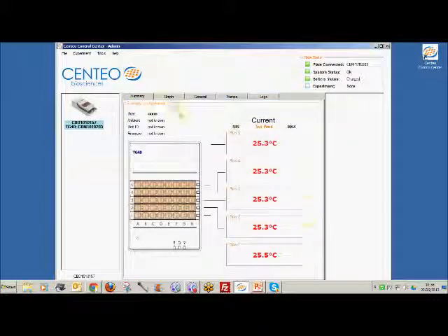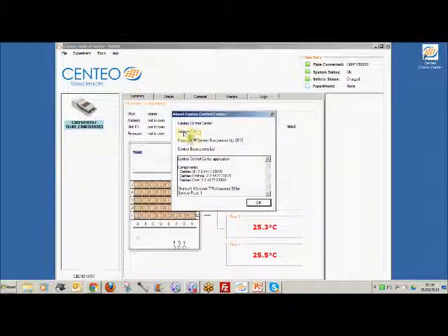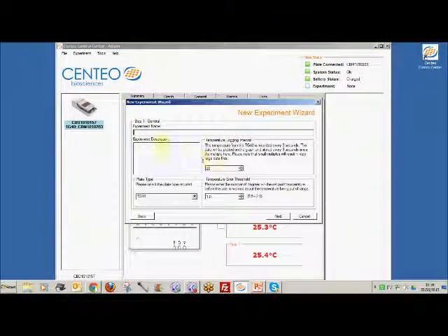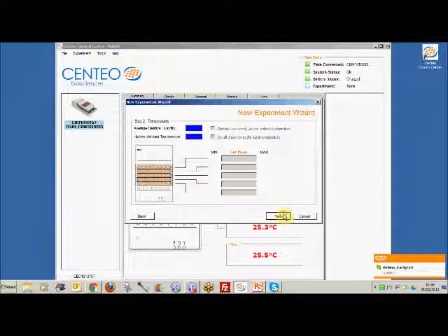So, in summary, if you want to know what version of software you're running, just click the help, go to about. It should be running version 2.2. And why would you want to do that? There are some new features in the software. It allows you to change the save rate, allows you to change the warning limits around how far away from the set points you are, and it also importantly asks this question about relative humidity. And as I say, you can use your judgment to override that. That's your choice, but it's in the new version of the software.